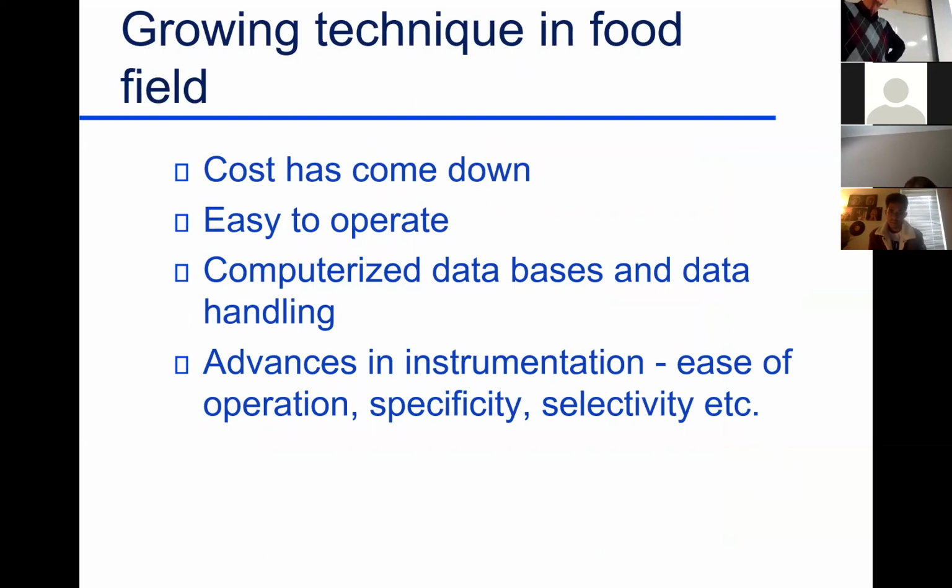But it is an amazing technique. It absolutely fascinates me, all of the ways this is used today and how it's evolved throughout time. It touches us in so many ways. At one time, this was only for the elite laboratories, experimental laboratories. Cost has come down a great deal. So instead of maybe spending $400,000 or $500,000, I might be spending $100,000 today. It's brought it into the hands of everybody. That's a very reasonable price for what you get.